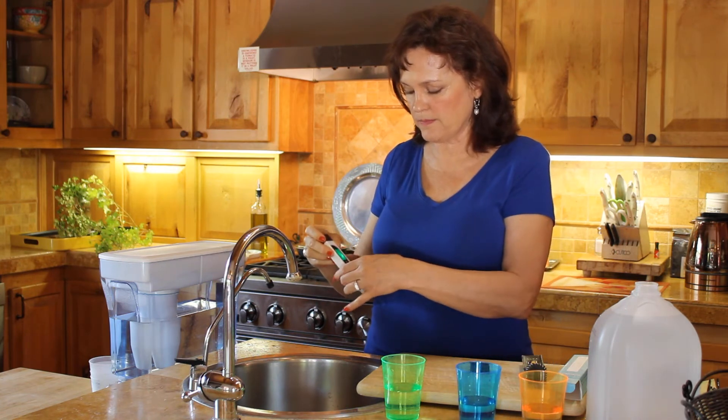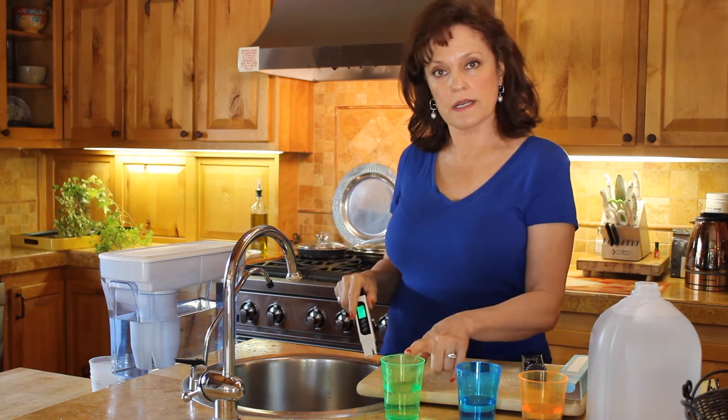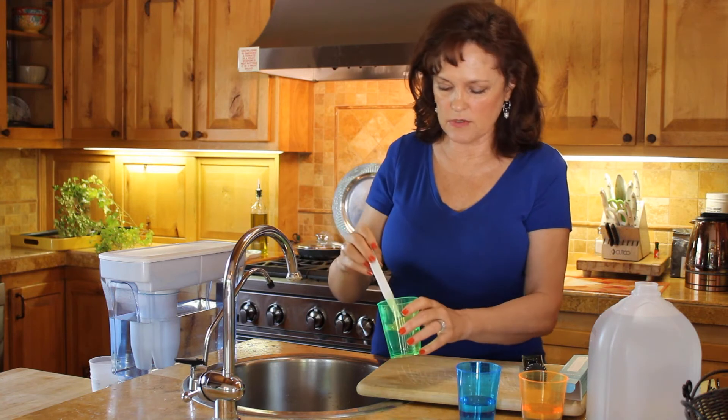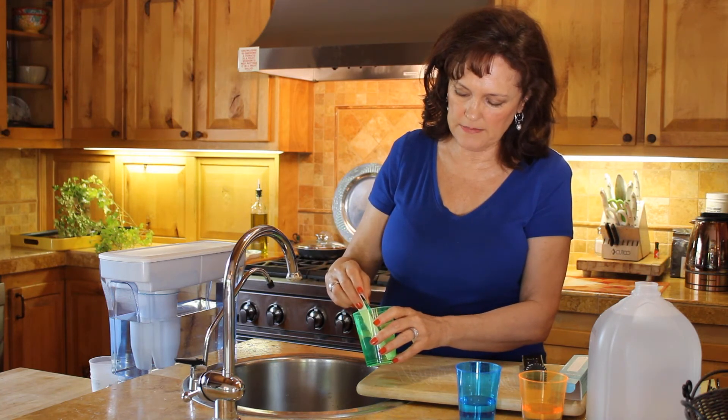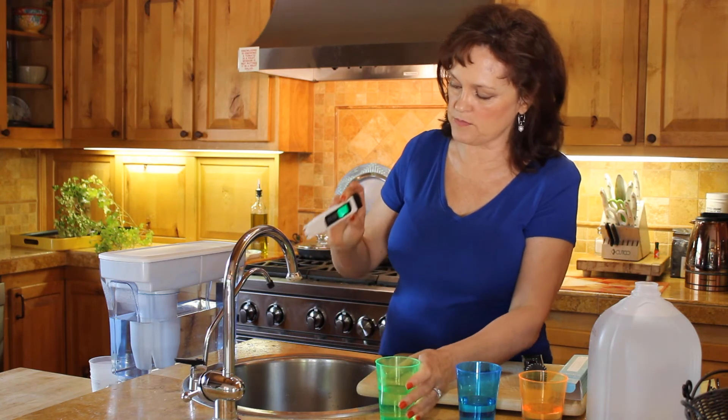Now we're back at zero and we're going to test our reverse osmosis water. Reverse osmosis is coming in at about 30 parts per million.